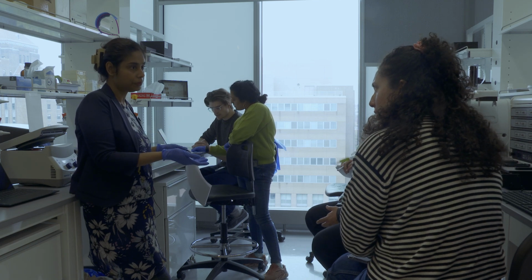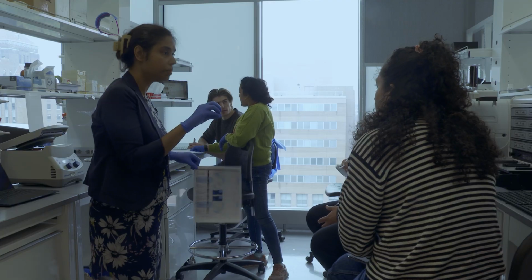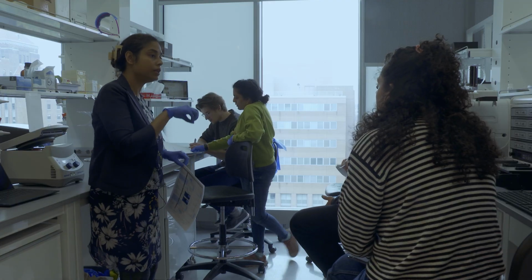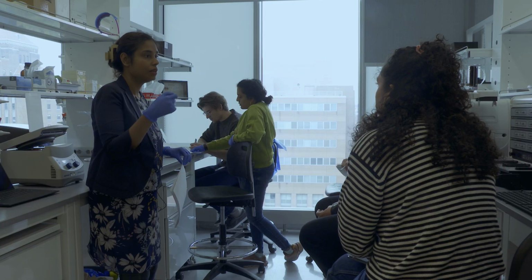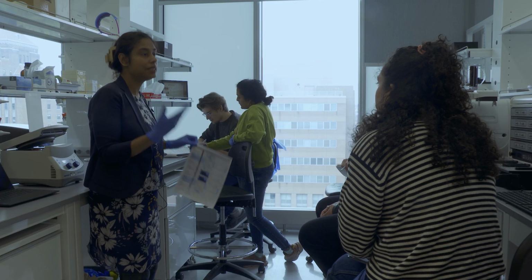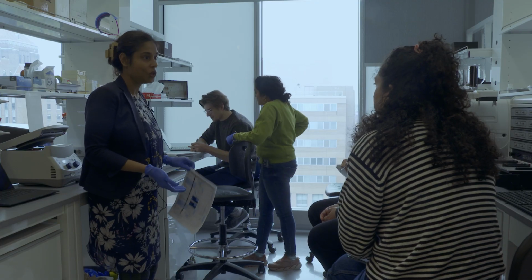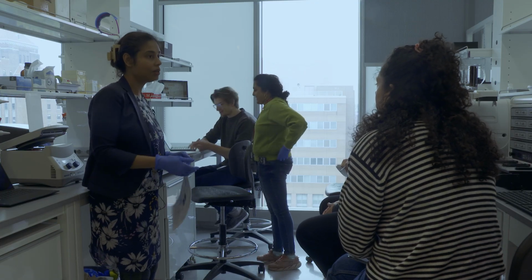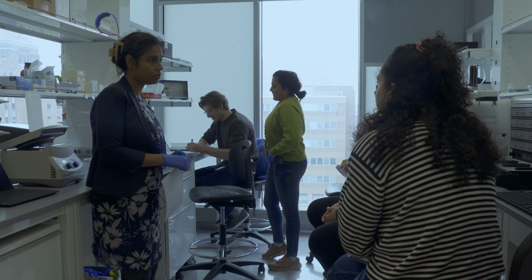Using the sample that was still in the gel? You can just cut the band, right? Whenever you cut the band, you have only that particular band in your Eppendorf. It's called the crush and soak method. Because DNA is a nucleotide, it is water soluble, so the buffer is always water based, not any organic solvent.